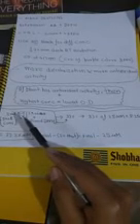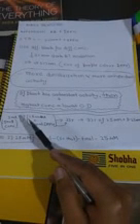Remember guys, in the last page I told you that we are going to use 25 micromolar of ascorbic acid and that it was its end concentration. What I meant by that I'm going to tell you about. Suppose we are using 2 ml of assay, in which we put 1500 microliter of ascorbic acid plus 500 microliter of DPPH. And this ascorbic acid that we are using is 25 micromolar, but after putting this additional 500 microliter, its concentration will get decreased.